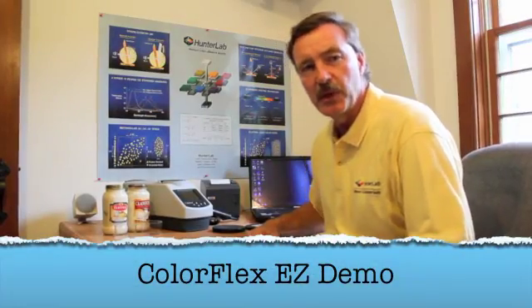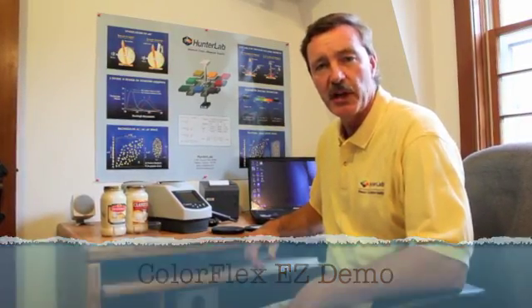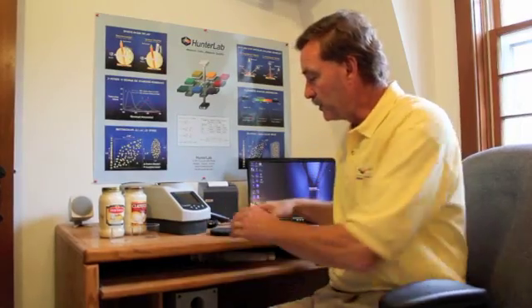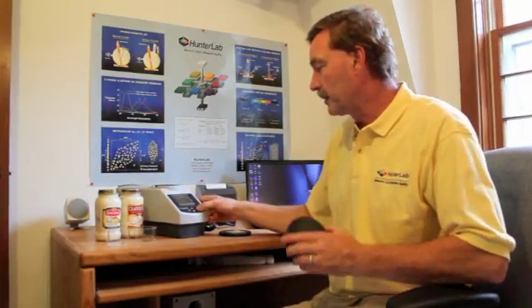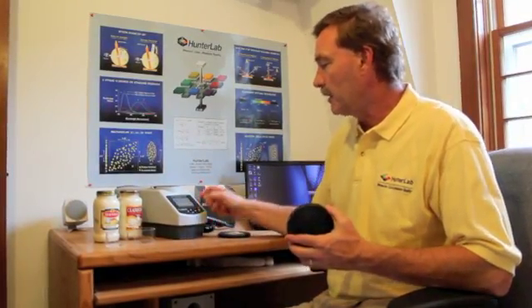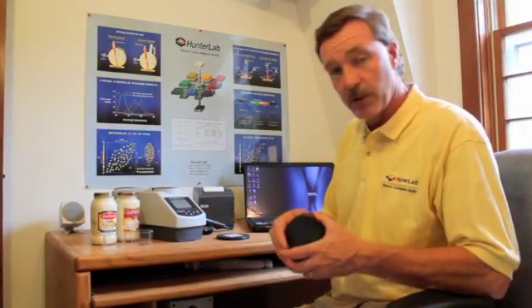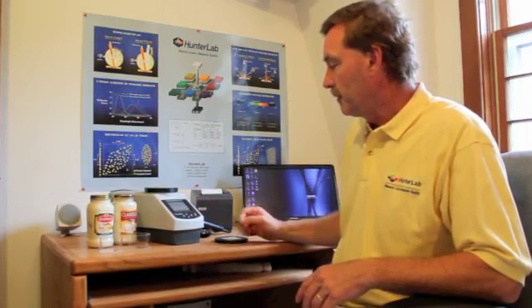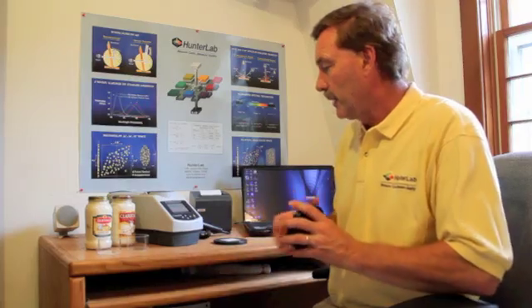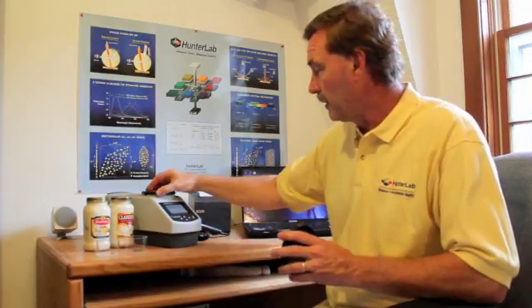Before taking color measurements with the ColorFlex, we must first standardize the instrument. We do this with two tiles, both a black and a white tile. The sequence is simple. We push the key labeled standardize, and it prompts us to take a reading with the black glass. We now are prompted to measure the white tile, and the display states the sensor has been successfully standardized.